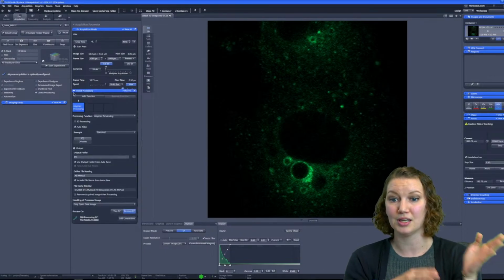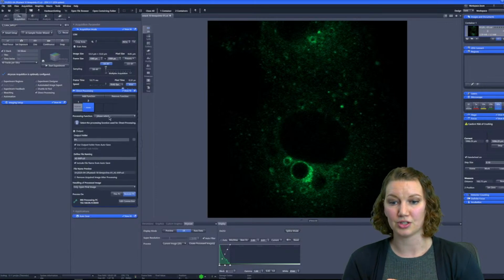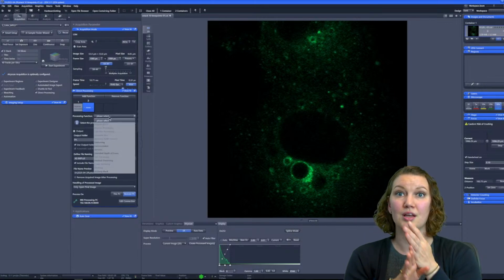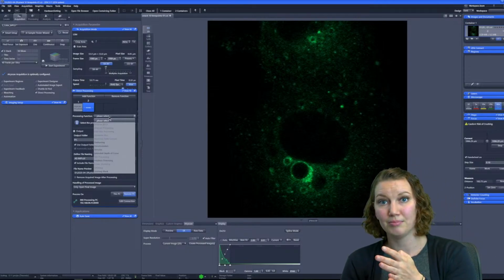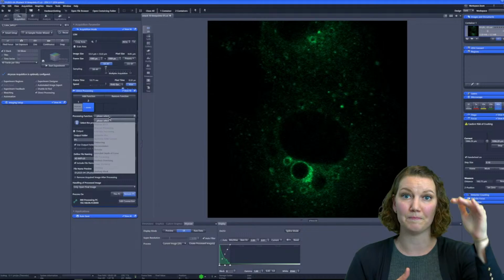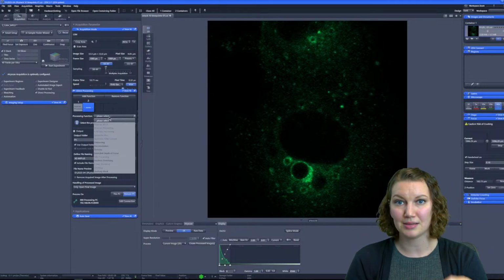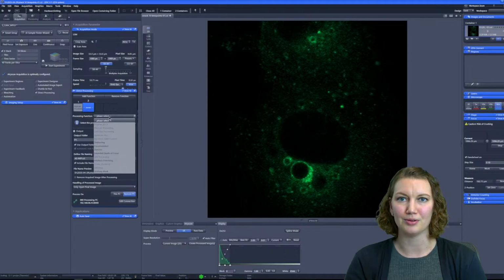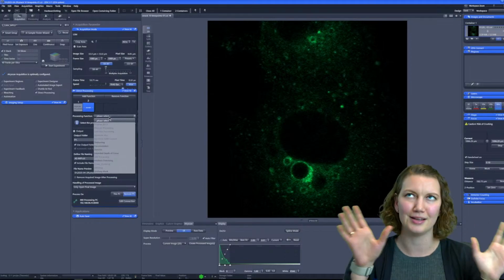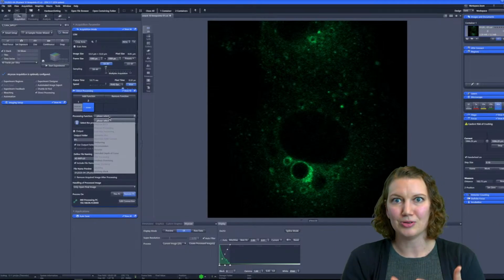So it's really nice when you build it into your experiment, which I'll do here. I'll have the Airyscan processing function added, and then you can also build out additional functionality on top of that. I want to do my Airyscan processing, but in this case, because I'm also taking a time-lapse Z-stack, at the end of this, I want to see what that max intensity projection looks like immediately so that I can see if I captured my endosomes transporting whatever molecule of interest potentially, as an example. Here we're just looking at 1 color. But, right, you want to see that as soon as it's done.